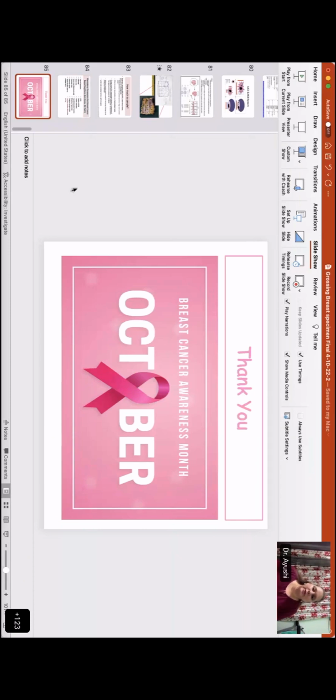It should be there along with your histopath requisition form so that you can look for it, because most of these markers, as I said, are gold color. While serially slicing, even if it is there, you have to really hunt for it sometimes. And in the post-chemotherapy specimen it is the most important, because that is the site that will mark the tumor bed, even if you cannot identify it grossly. So knowing that such a marker is there is a big help, and you have to document that yes, we have identified the marker and sample the area around it.